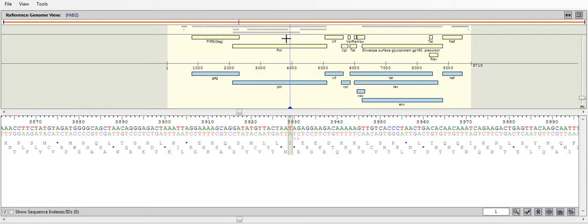The panel containing the smaller grey bars is called the Miscellaneous feature panel and shows all the other features. These can be coloured by feature type. When a feature type is selected to be the feature focus, it's swapped around from the Miscellaneous panel to the feature focus panel. The track bar to the right allows us to zoom in and out of the features.